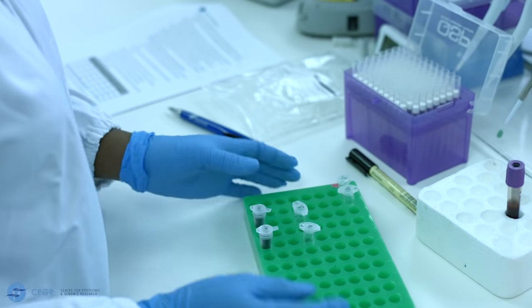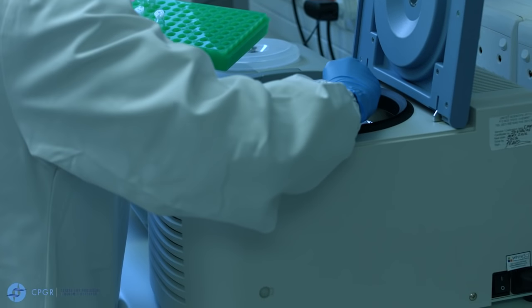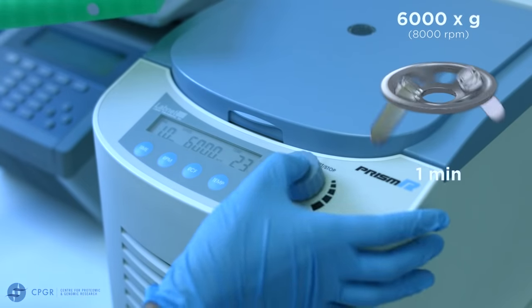Close the spin column and centrifuge at 6000 g, that's about 8000 rpm, for one minute.